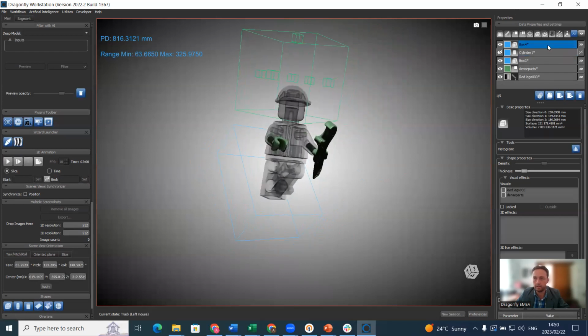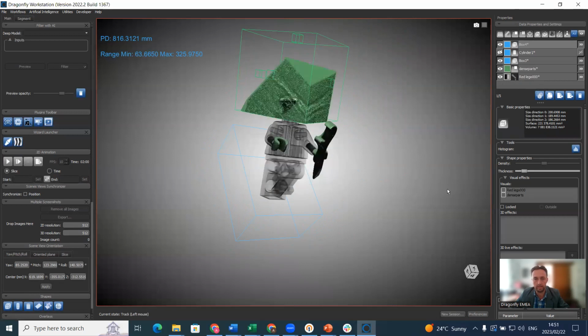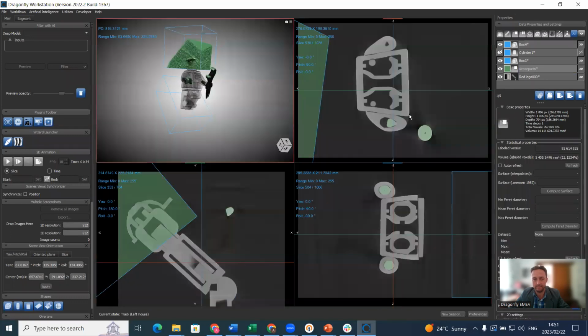So let's do that, and then we can say add to ROI. Add two dense parts. Ugh, now it's added everything in there. So that's not exactly what we wanted. So what you could do in that region is, of course, do it different ways also.